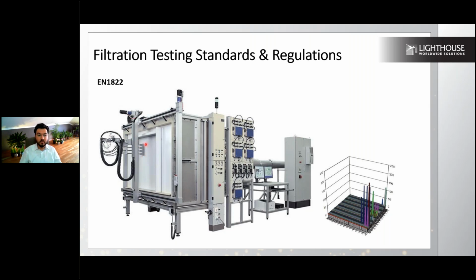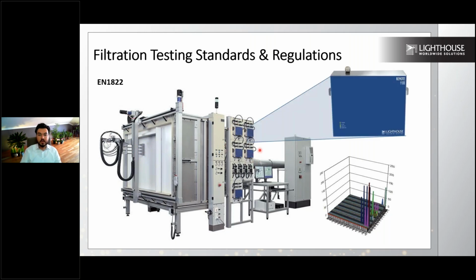As you can see, there are 4 scanning probes connected directly to the particle counters, with a size like 0.1 micron, because you want to scan 0.1, 0.15, 0.2, 0.25 in order to see the narrowest possible area for your MPPS value. Remember our graph? We have an MPPS value which is in between 0.1 to 0.5 micron. So having smaller increments between these channels is important. That's why this 8-channel particle counter is installed in many filter testing companies in order to verify our filtration.